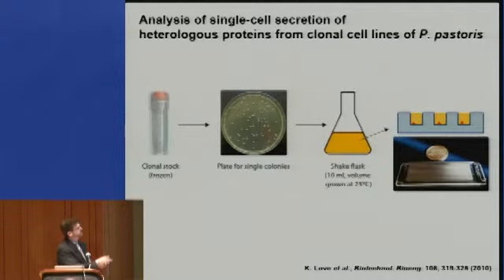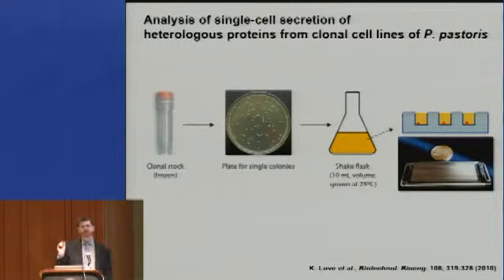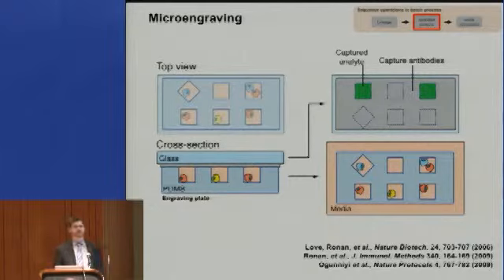What we can do then is vary the conditions of production and extract cells from that reactor in real time and sample them using an array of sub-nanoliter wells. It's very similar to the etched arrays that David showed earlier in the fiber optics. Here, the chip is made out of polydimethylsiloxane. On this chip, there are about 85,000 containers, so the equivalent of about 1,000 96-well plates. Each well is about 100 picoliters in volume. Because of this very small size, we can make measurements on these individual cells that you might not otherwise be able to do in bulk.